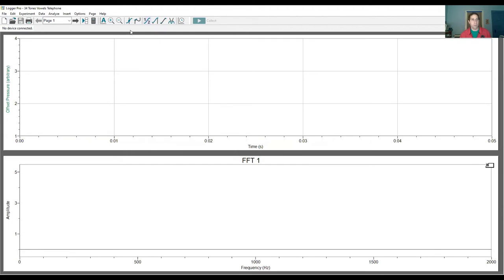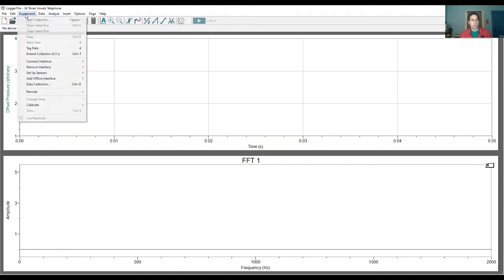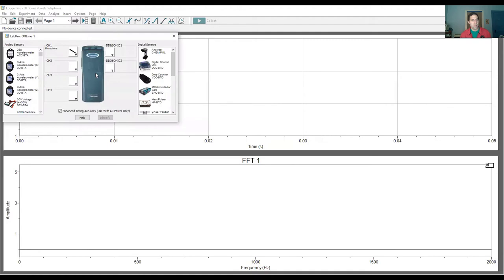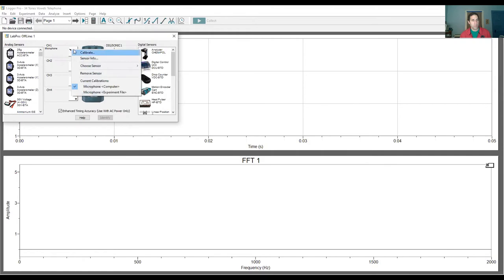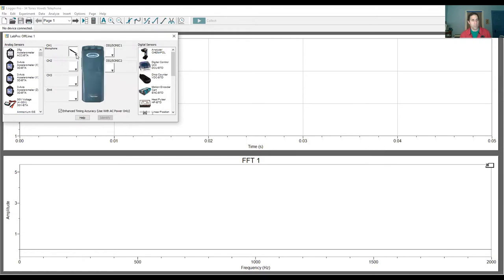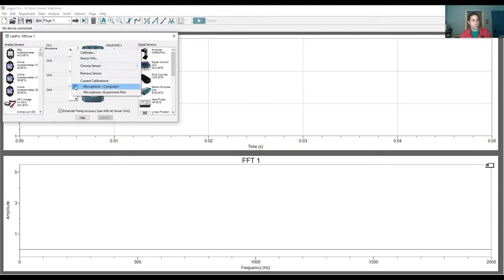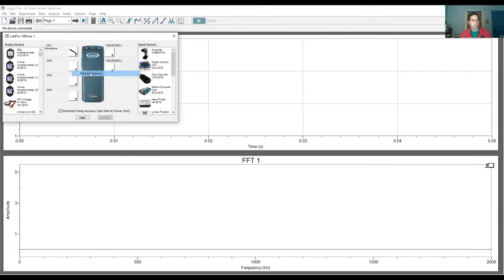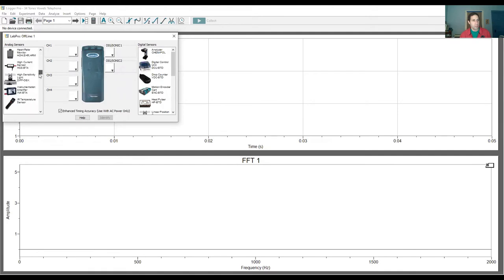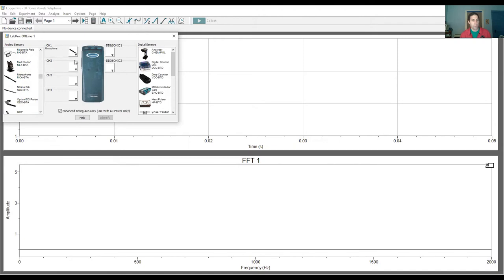And what you'd want to do, if you don't for some reason see it, go over here to Experiment, set up sensors, show all interfaces. And then from here you can basically pick, notice this shows Channel 1 microphone here. If this didn't show Channel 1 microphone, you could basically, let me take this off actually. Remove sensor. So notice if I didn't have this, then what I could do is I would come down here, search for microphone, click here, and move it into Channel 1. So you might have to do that, hopefully not.